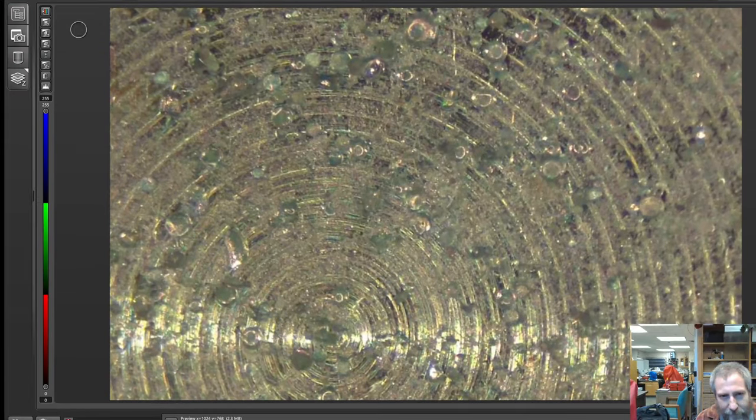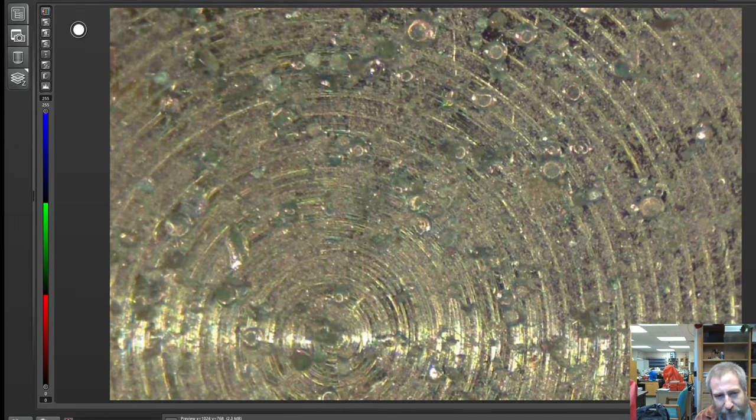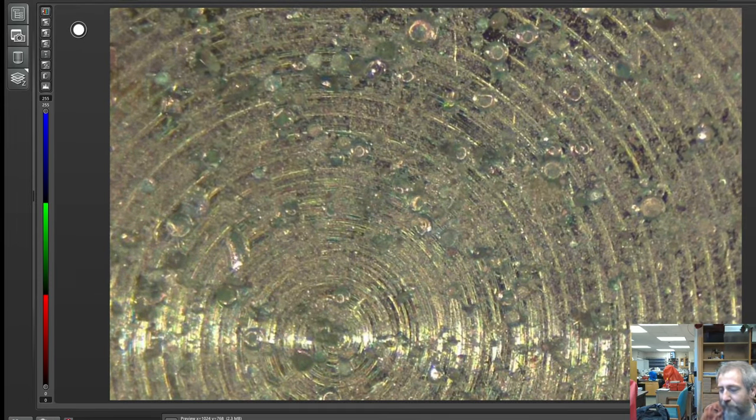And that's them. This is what it looks like. So, I think it's a lot less appealing than in the scanning electron microscope, but not ugly. Just you can't see much of the detail. And in previous streams, we've actually used this device back here, which is the micromanipulator. We could pick these things up and reposition them on slides, and we did that a little bit.